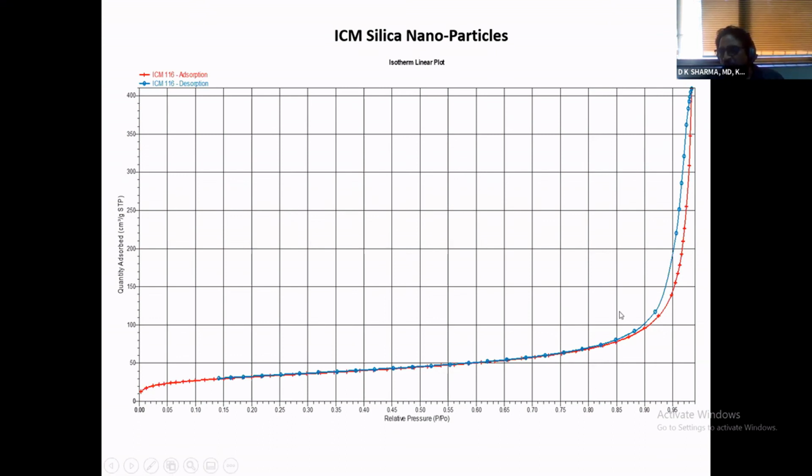So, which shows that this is not porous. This is not particle porosity. This is basically interparticle voids, which fall in the size range of mesoporosity, and that's why it shows up as mesoporosity in the isotherm. It is actually void.